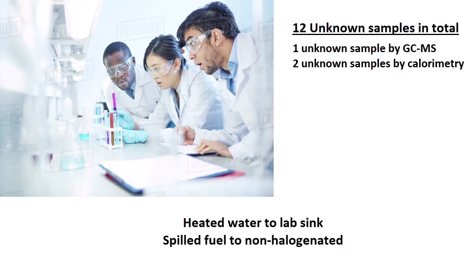Lastly, this lab will have minimal amounts of waste. All heated water will be poured into the lab sink. If any fuel is spilled, it must be disposed of in the non-halogenated waste container.